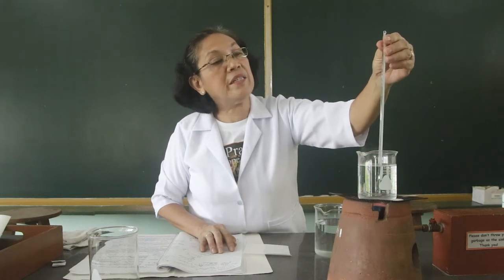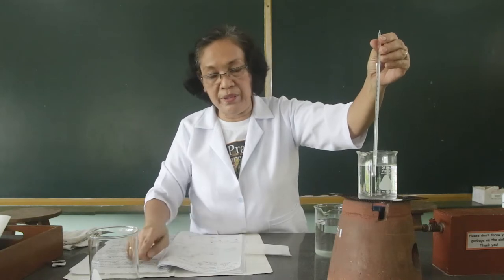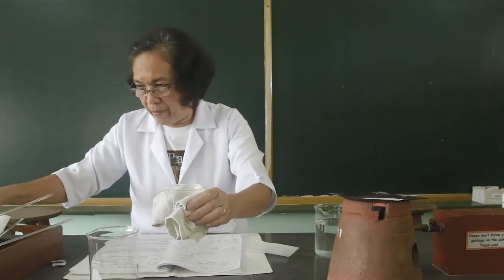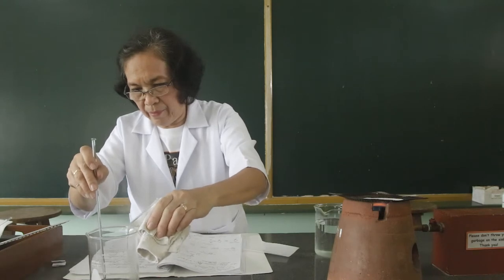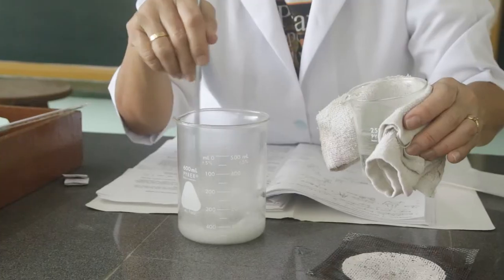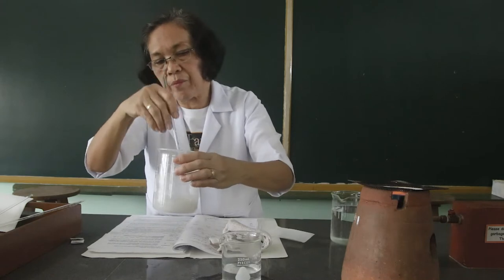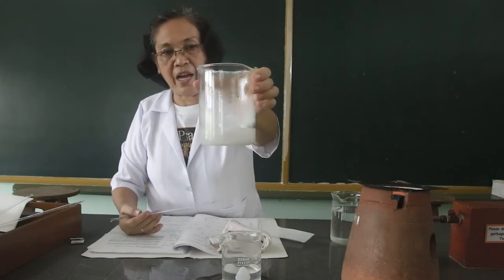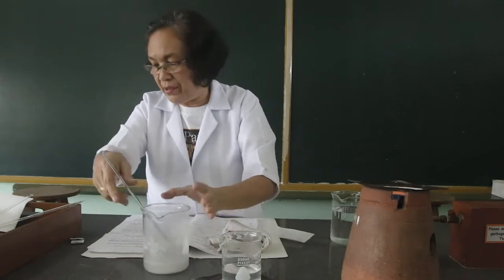Now the temperature of the water is 90 degrees, so we are going to use this to dissolve the acetanilide. We have already dissolved the acetanilide crystals, then we are going to add here the activated charcoal.